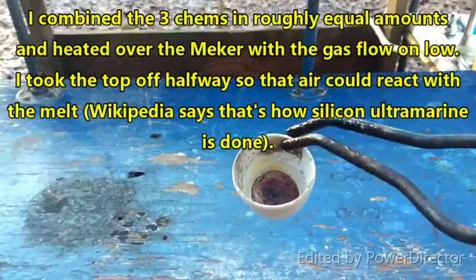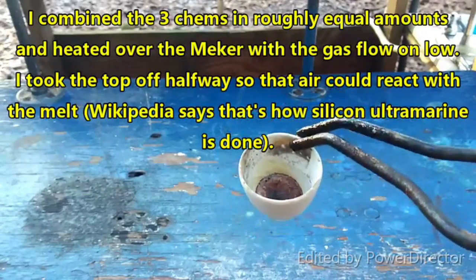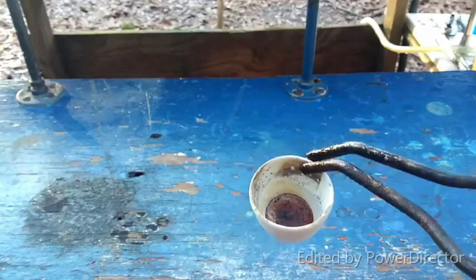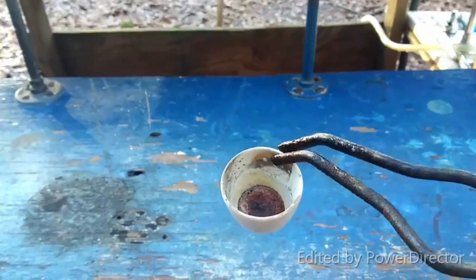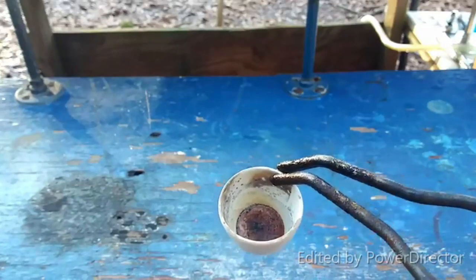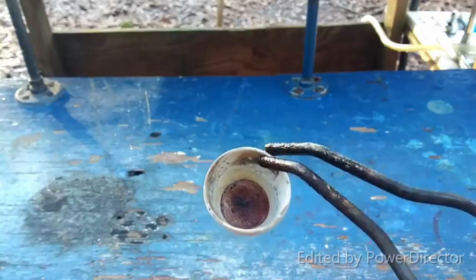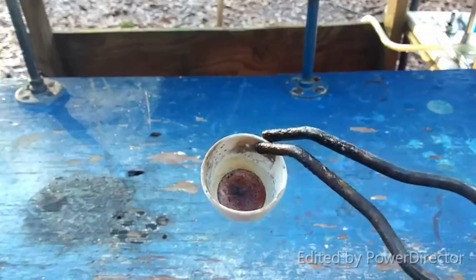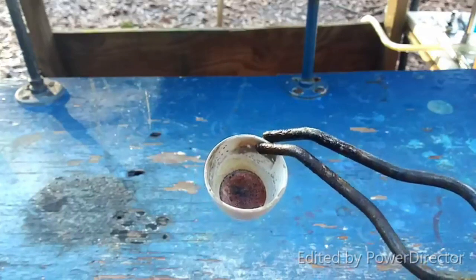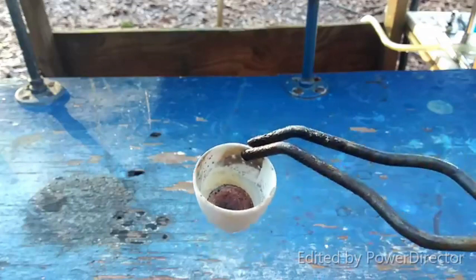This is an update on the germanium ultramarine experiment. The only blue I'm getting right now is right around the edge of the mass at the bottom — you can barely see it, but there is a blue color there. Basically, I took the mixture of germanium dioxide, sodium carbonate, and sulfur and cooked it over the Meker burner on low, with the crucible down in the flame, so it cooked at a pretty good temperature.